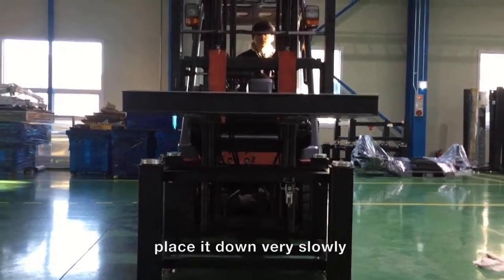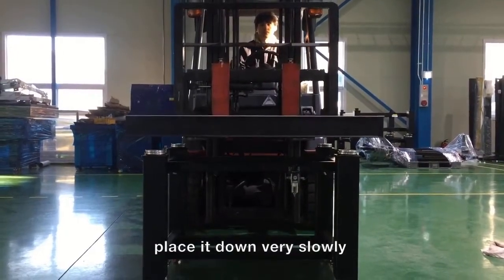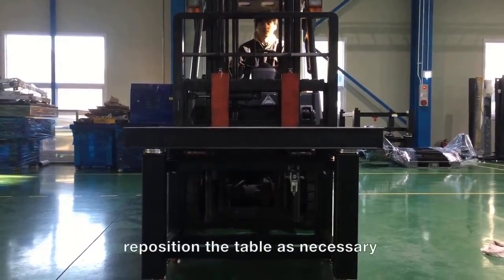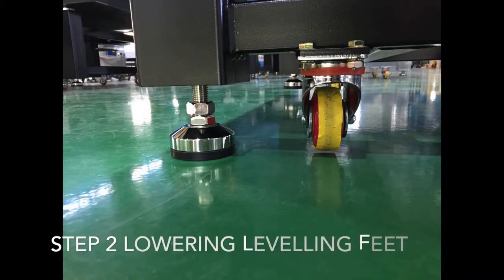We recommend a forklift or a crane to lift the plate. Slowly lower the plate so that it is ideally placed on the frame. Move the frame or the support feet, if possible, so that they are within the white circles.